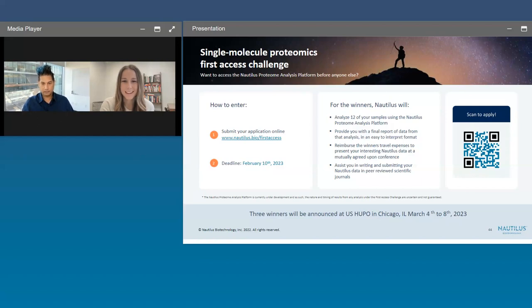Now let's get started. Our first question has a few questions within it. It says, great presentation. Thank you for sharing this wonderful study. My queries are, is it only qualitative, saying only whether proteins are present or not? Can this technology be used for quantitative analytical assays, such as preparing calibration, measuring proteins quantitatively? If quantitative, do you know the sensitivity of this technology?